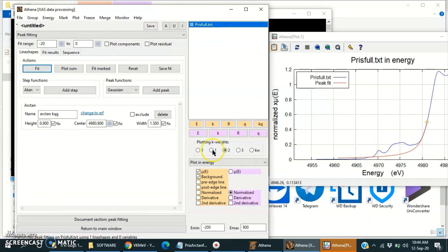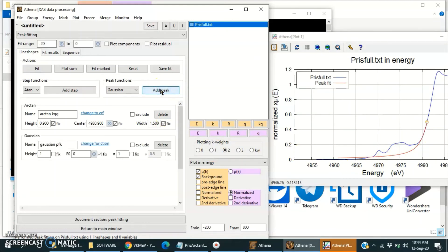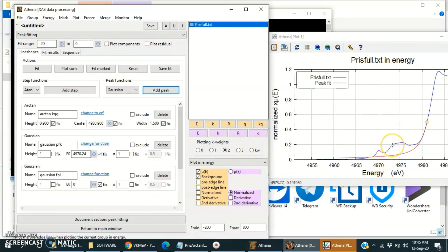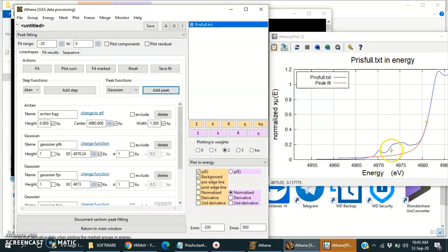We will add one peak — position of this peak is 4970.24. Fix it at 4970 and again add one at 4973. Again add one more at 4975. Here I see the energy is 4975.8.